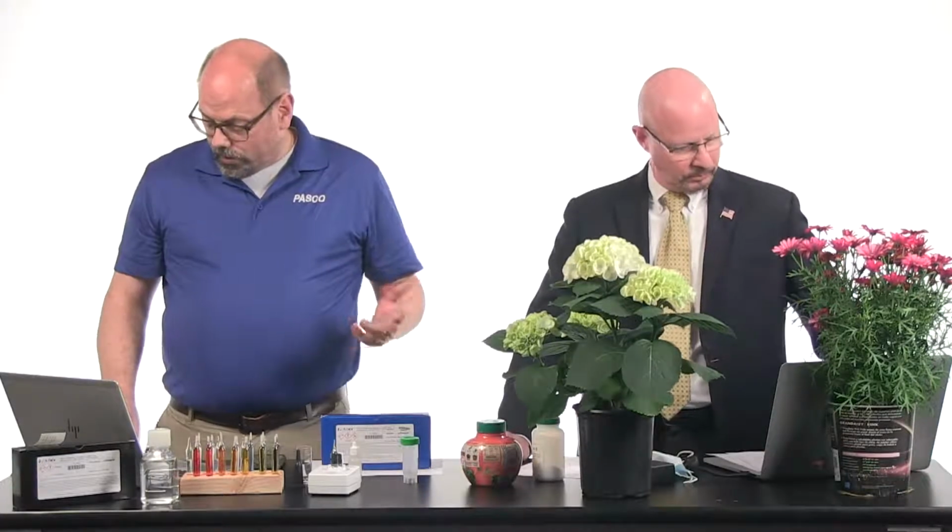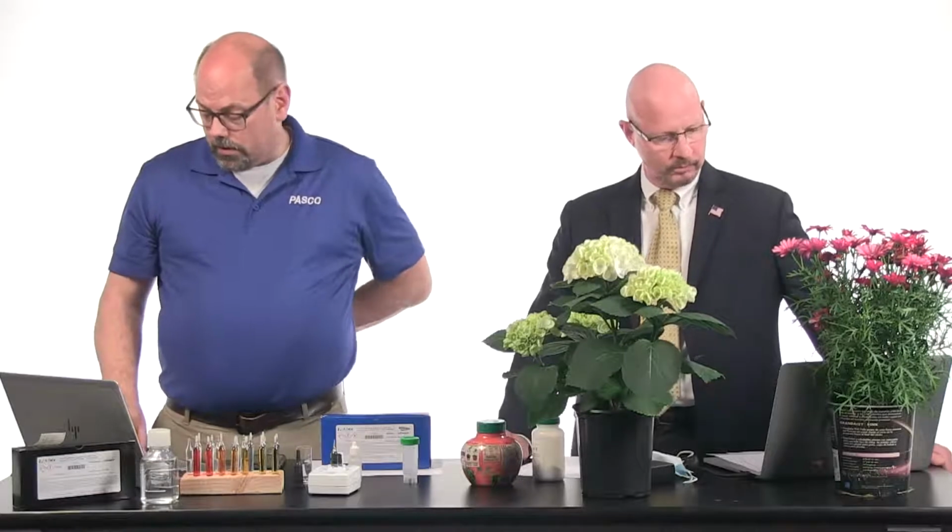Again, 0 to 10 is sort of the acceptable range. If it's over 10, the EPA standards say it needs to be dealt with. So that is going to give us those kinds of values.